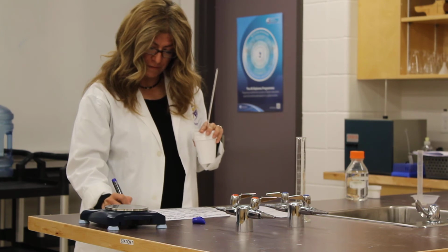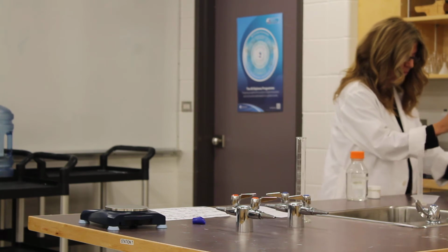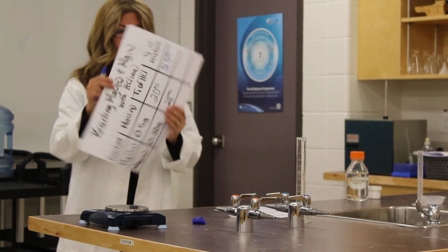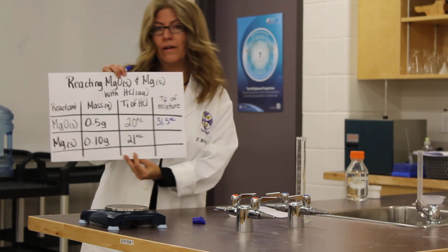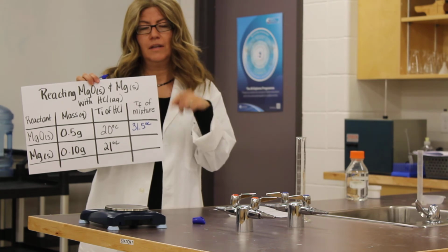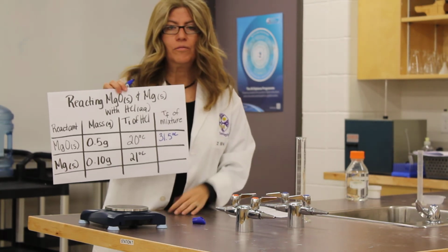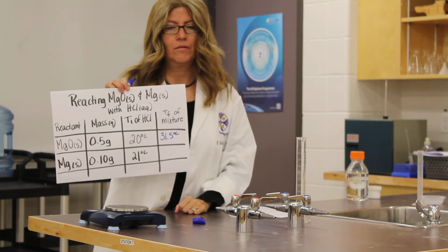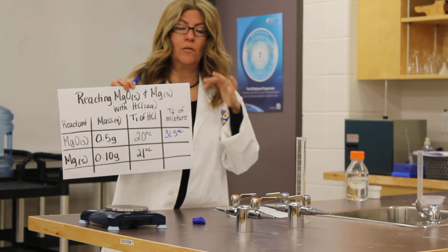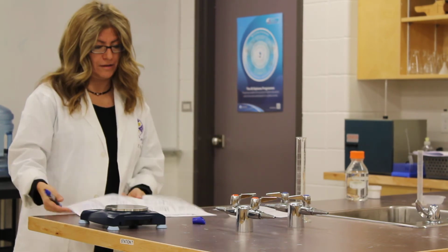31.5. This one's higher, at 34, just about 35 degrees Celsius. So I think I'm just going to keep going. Right now I've just put in 31.5 degrees Celsius. And when I get the next temperature, I'm going to pause the video and come back and show you all the work that has to be done. And hopefully it will all make sense. Okay, kiddos? Hang tough for a couple of minutes. I'll pause it once I get the change in temperature of the magnesium plus the HCl.